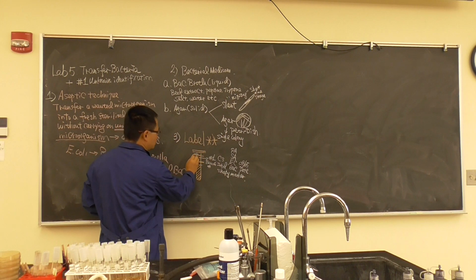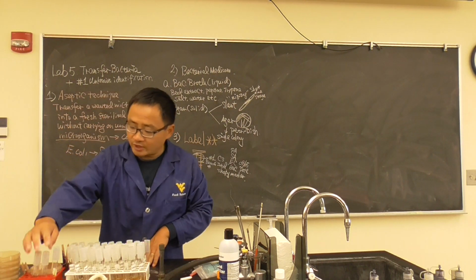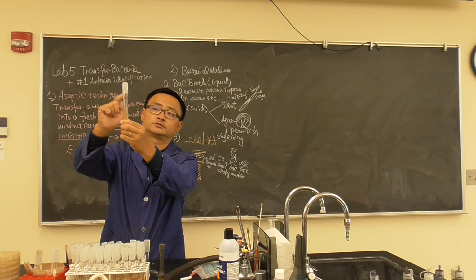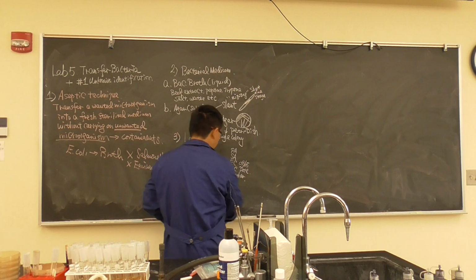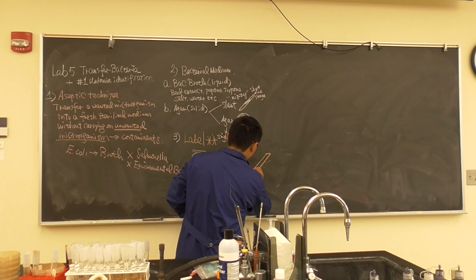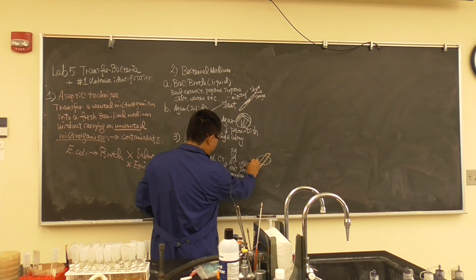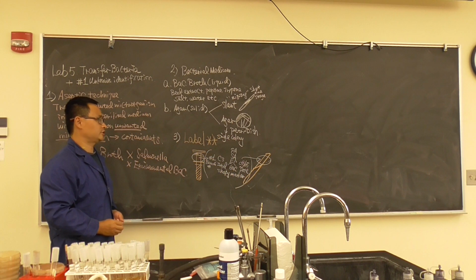Right in this area, on the top. Now the second question. We have a slant where we should label. You label right on top, on this circle. So if we have a slant, we're going to label the circle right here. The same information goes there: bench number, initial, bacteria, and the date.